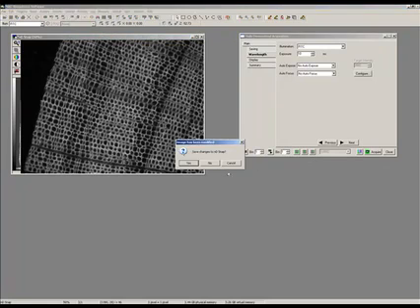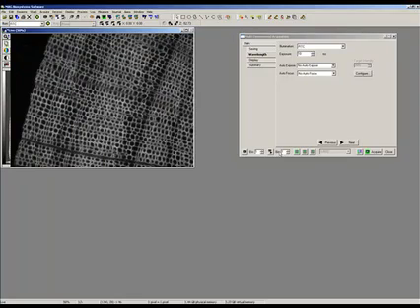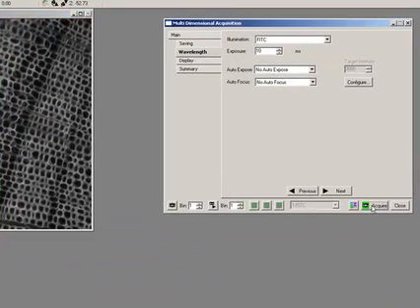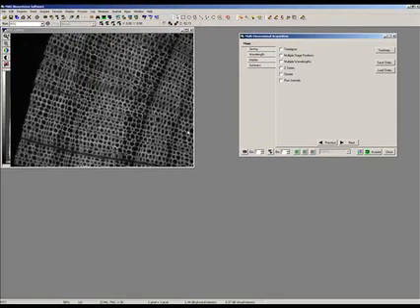So let's close that one, and let's have a look at how I would actually save that picture. So if I go to live, I get my picture up. It's actually the buttons over here that are acquire. If I hit acquire, that actually saves that image to that particular folder so I can go and get it later on.